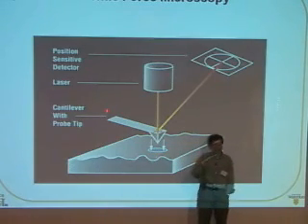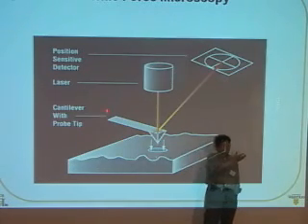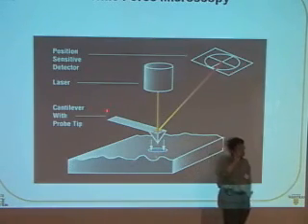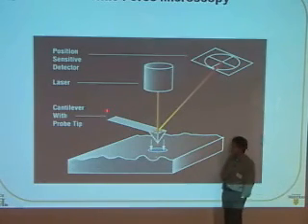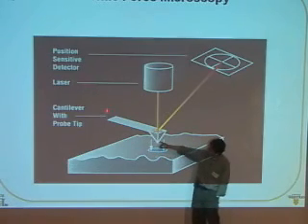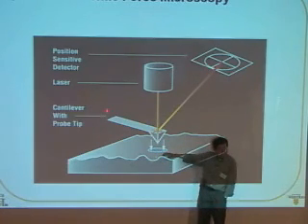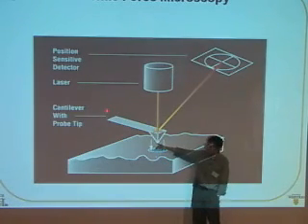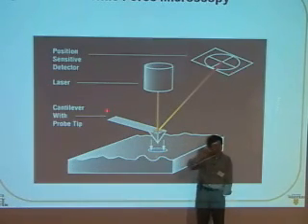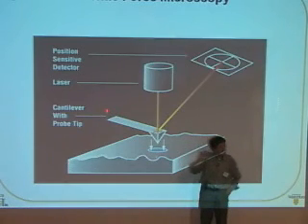Now, here we have a very different length scale. Most people who talked before me talked about the smallest scale being on the order of microns, and here we talk about nanometers. A nanometer is 1/1000th of a micron, so it's 3 orders of magnitude smaller. When you have such a small sharp tip, you can move it so close to the surface of the sample underneath it that it can detect the intermolecular forces, literally two-molecule interaction.